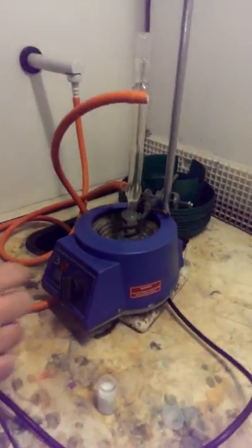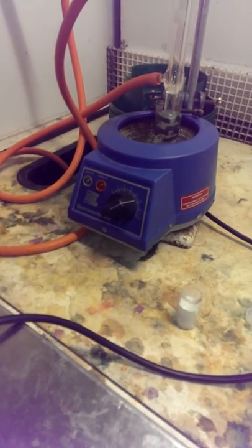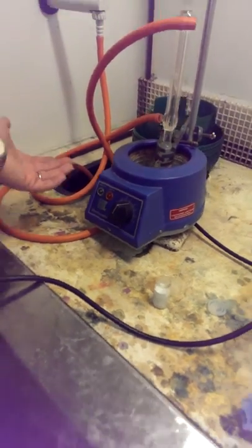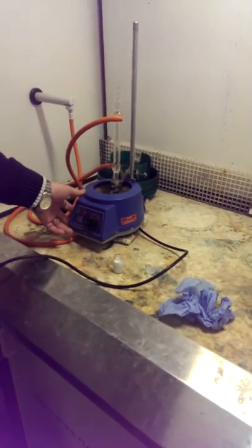Set the mantle going, switch on at the mains, start to heat, power on, yep, and you start to heat. And that should set you up nicely. Each gauge point is about 30 to 40 degrees, so set your heating mantle as appropriate.